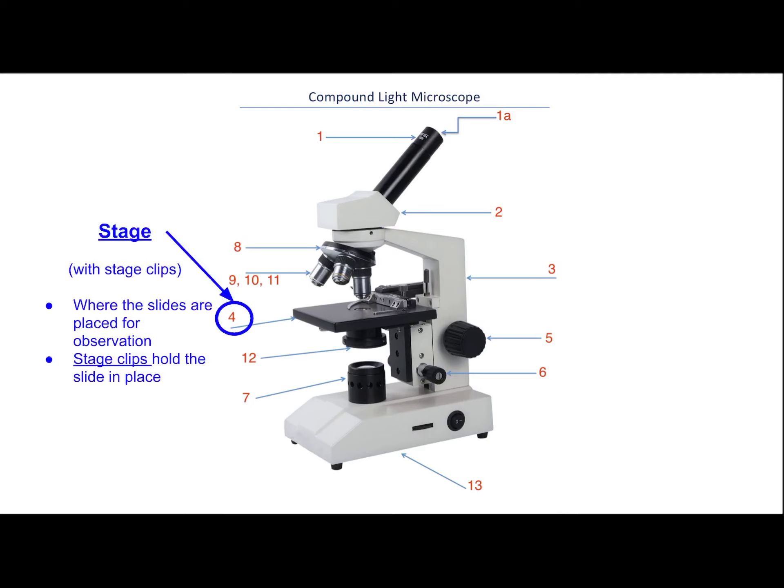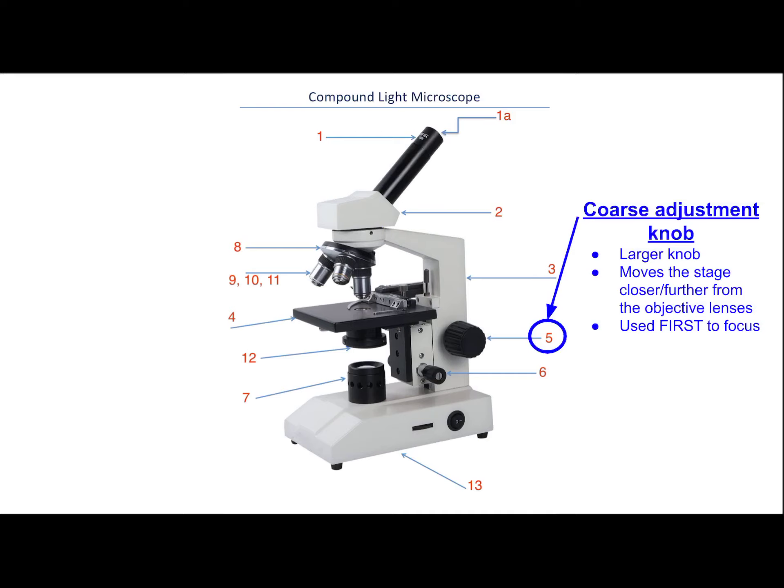Part number four is the stage. The stage has stage clips on it — this is where you put the slide. The slide is placed on the stage for observation, and stage clips should be used to hold the slide in place. You press down on the back and the front part will lift up so you can put the slide in. You should make a habit of using the stage clips because if the microscope gets bumped, you might lose what you were looking at.